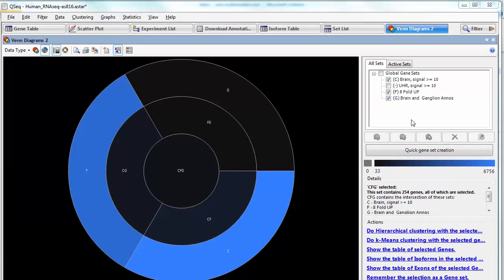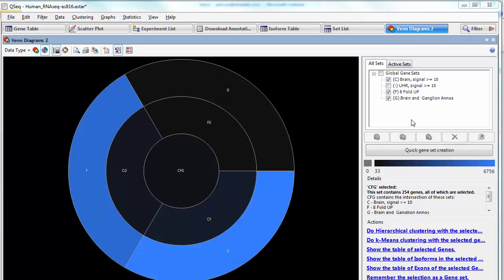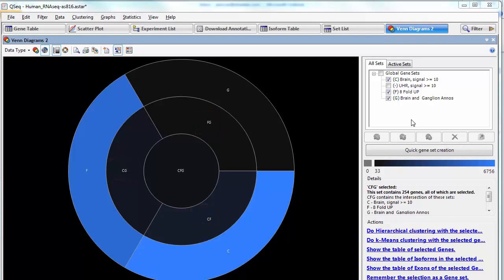Now, there are actually two different modes in the Venn diagram, and this one is the dartboard mode. This mode allows you to compare as many gene sets as you want. The dartboard diagram is organized into rings, with the outermost ring containing a single section for each of the sets. The next ring in contains sections corresponding to genes that are unique to each combination of two sets, and the middle always represents the group of genes that are common to all sets in the diagram.